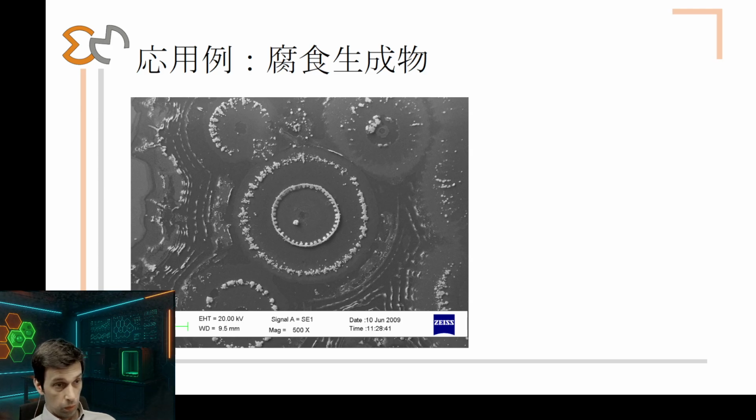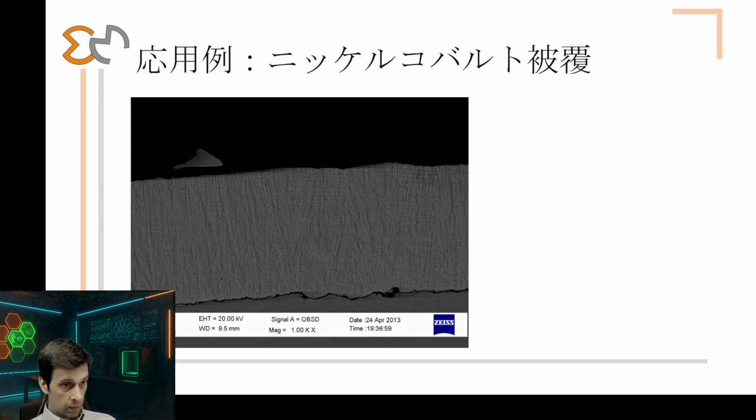These are nice small crystals of salt. They are deposited around some defects. So this is again a coating seen from the top. There are some holes, as you can see, and around these holes, these depositions occur at specific diameters, specific distances.